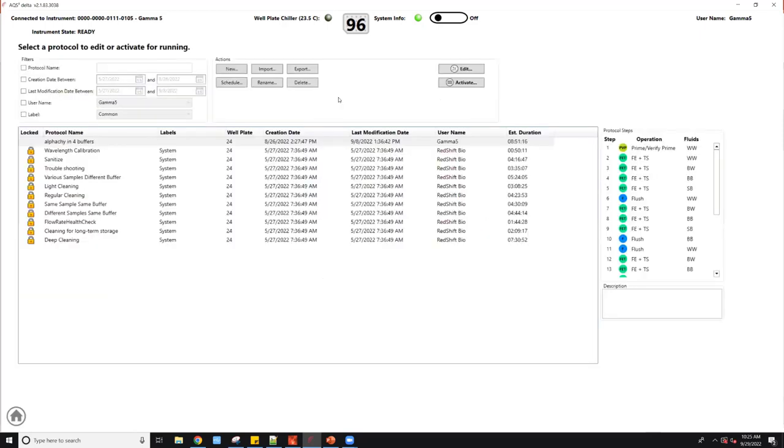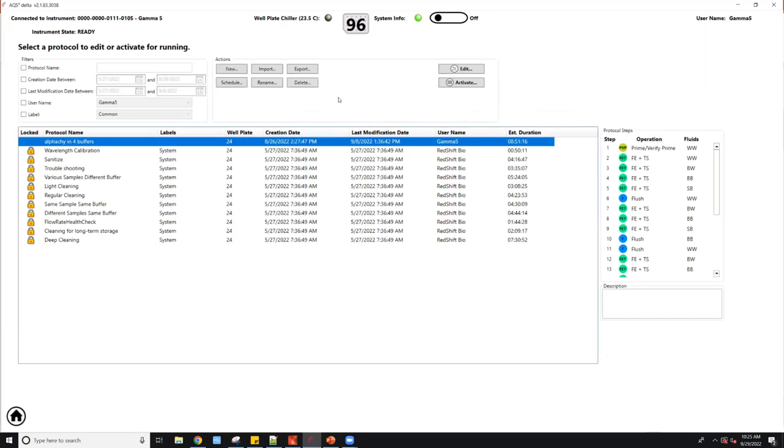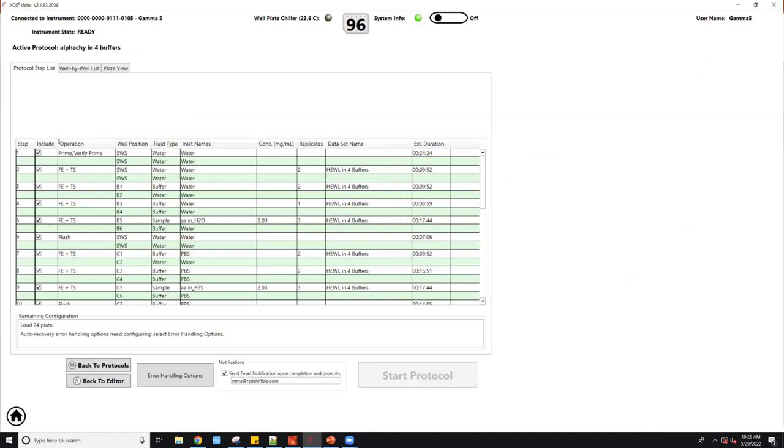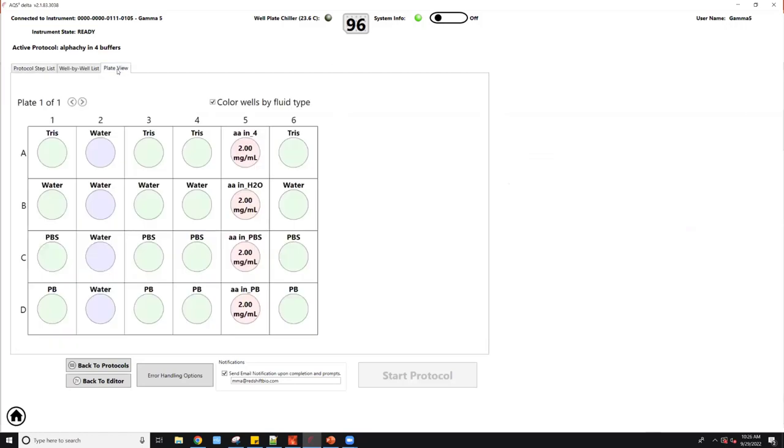You can also come to this protocol tab and here you can build a new protocol from scratch. You can import, export and schedule. You can schedule a protocol for, for example, time study or for maintenance. For example, we do a wavelength calibration every Monday morning before everybody comes to work. And it will just do it by itself. Here you can see the estimate duration for the whole protocol. For today, let's just use a pre-built protocol which we're gonna study. Although it says alpha chymotrypsin, we're gonna study lysozyme in four different buffers.